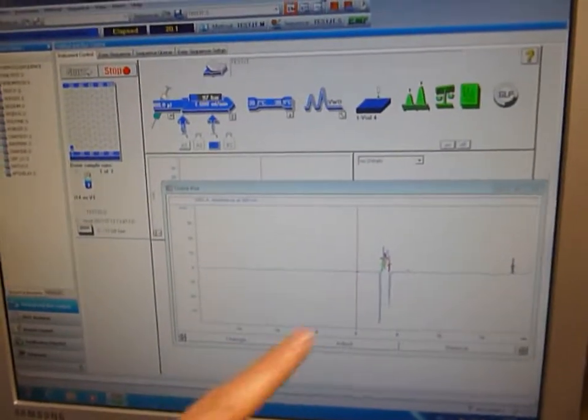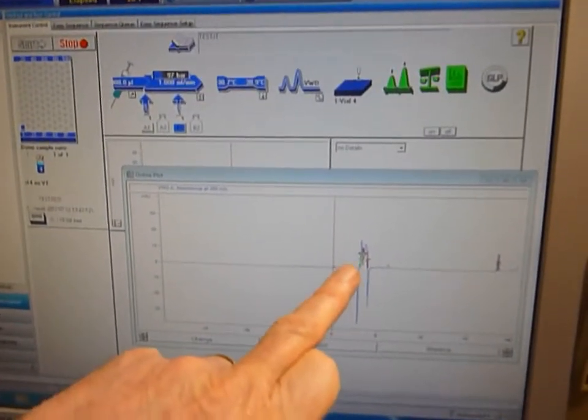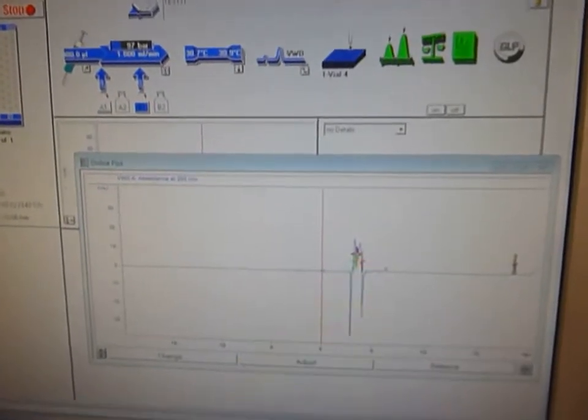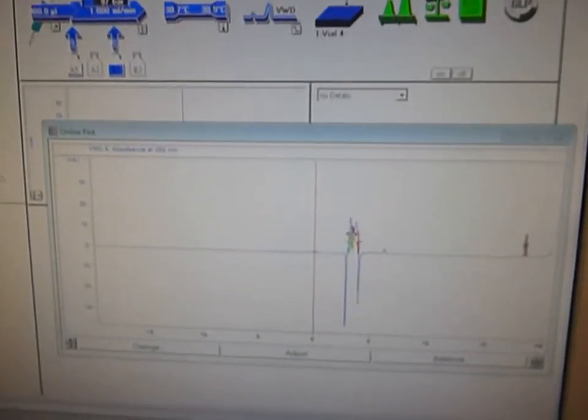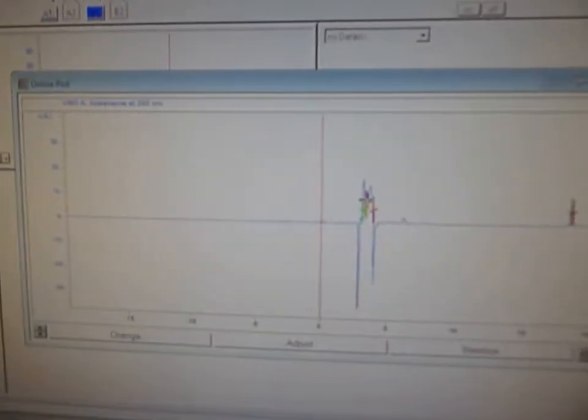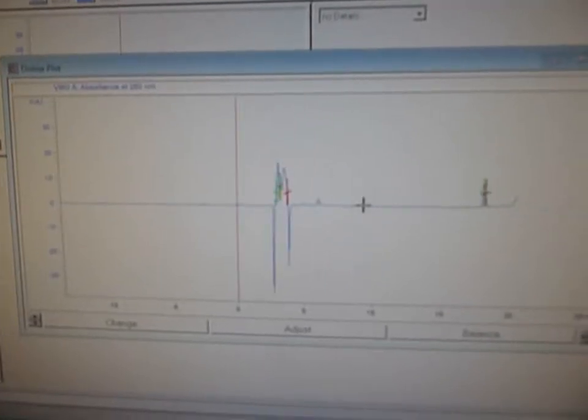And you can see the green light there is the start of the fraction collection and the red light there marks the end of the fraction collection.